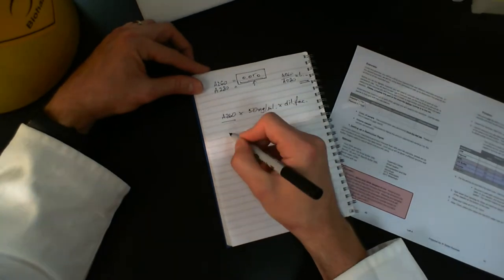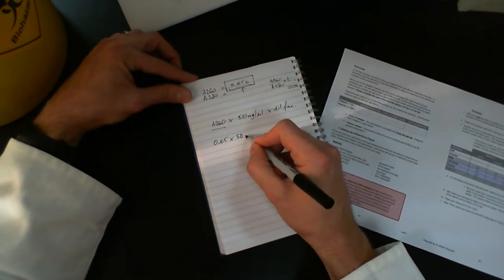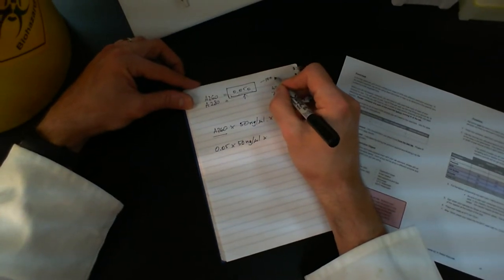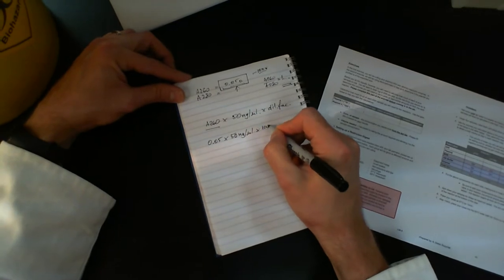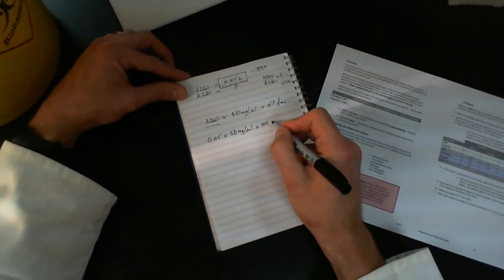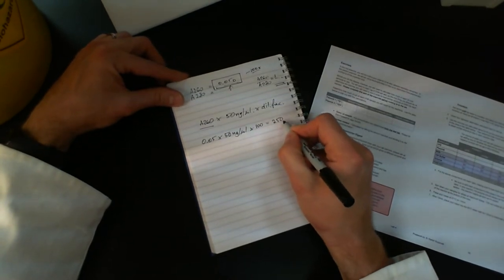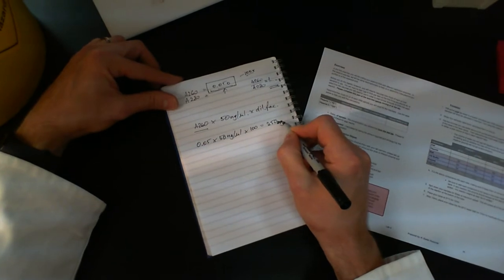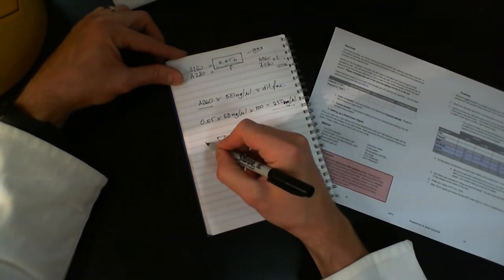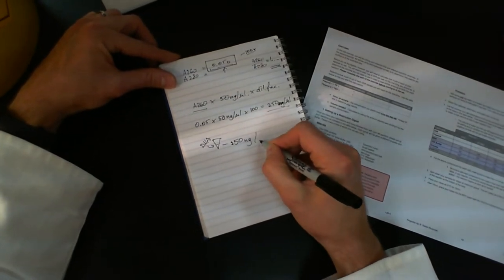In my case, I have an absorbance of 0.05. Absorbance doesn't have units, so I'm not going to put in units for that. Times 50 nanograms per microliter, times my dilution factor. This number was for the 100-fold dilution, so I'm going to use 100 as my dilution factor, because I want to know the concentration not of the cuvette I was measuring, but of the original sample I took out to make that dilution. So 0.05 times 50 is 2.5, times 100, so it's going to be 250 nanograms per microliter. That means the epitube sitting in my freezer right now, with the DNA I have extracted, has a concentration of 250 nanograms per microliter.